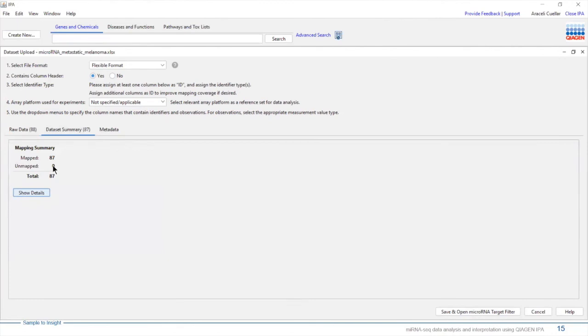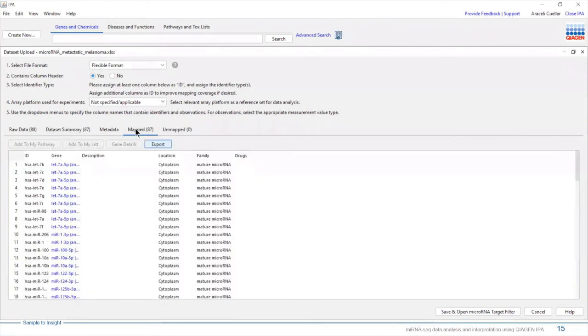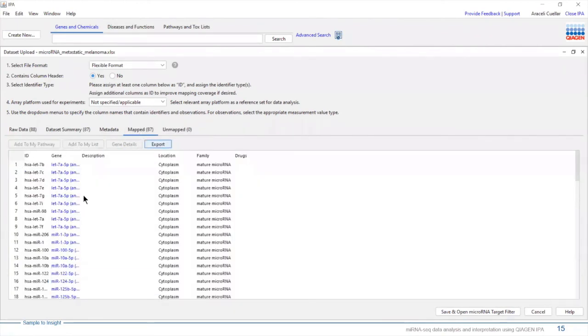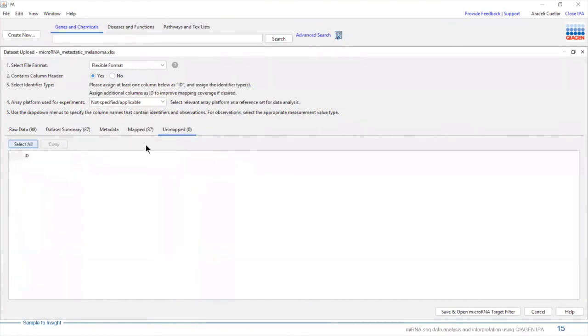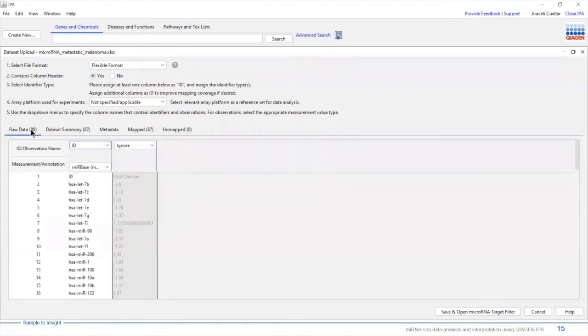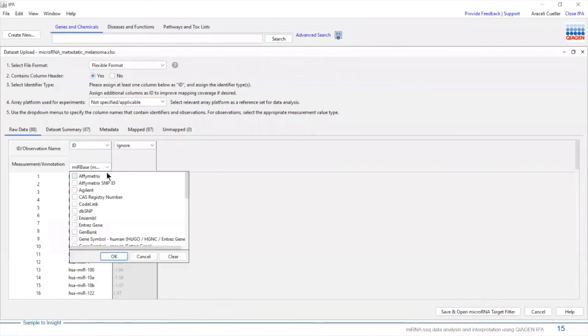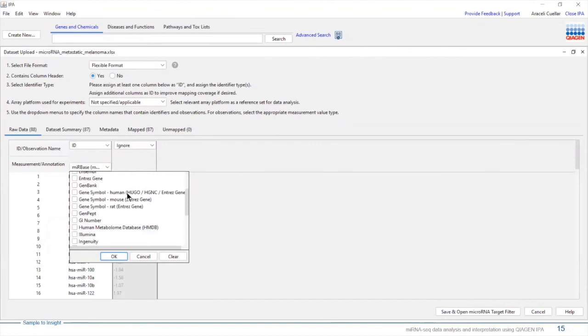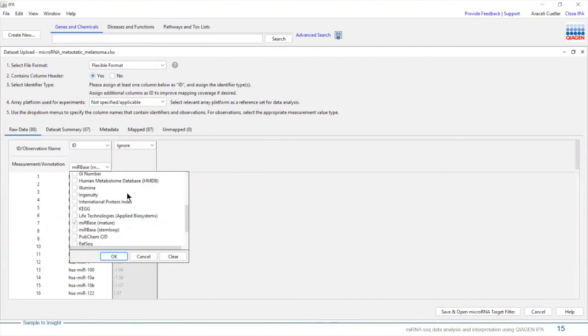When I do this, you can see that all of your microRNAs have been mapped. If you want to know further information about it, you can just click on Show Details, and you can see which ones have been mapped and those that have not. IPA recognizes various identifiers for microRNAs, but if you want to use the microRNA target filter, you need to make sure that you map to the mature microRNAs like you see here.